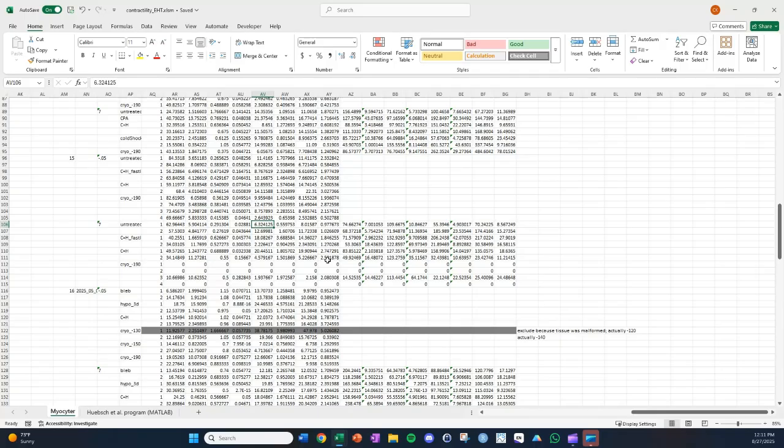And even if you do somehow convert that using the resolution and so on and get that into microns per pixel, in my experience, just knowing a little bit about these programs, depending on what's buried within MYOCYTER, the parameter values and so on, that value is subject to a whole lot of variation.